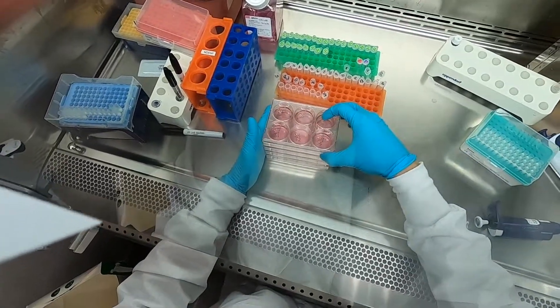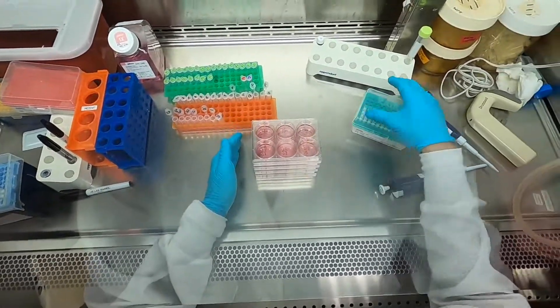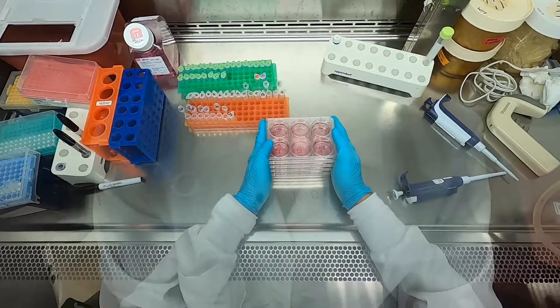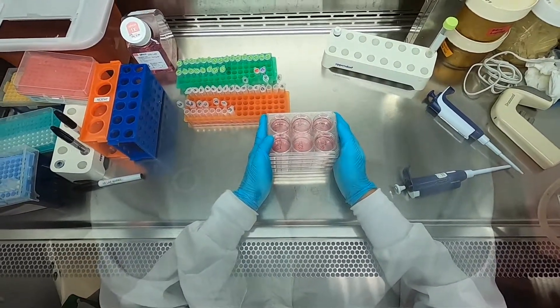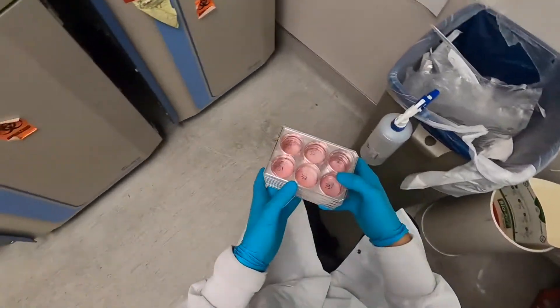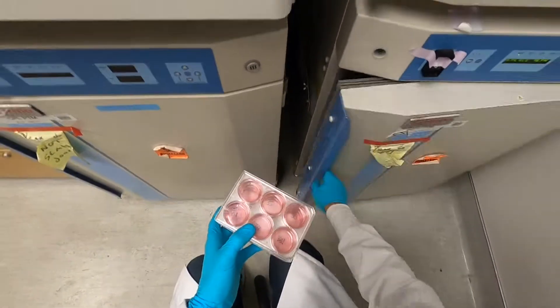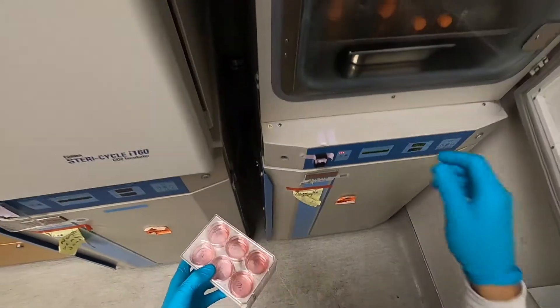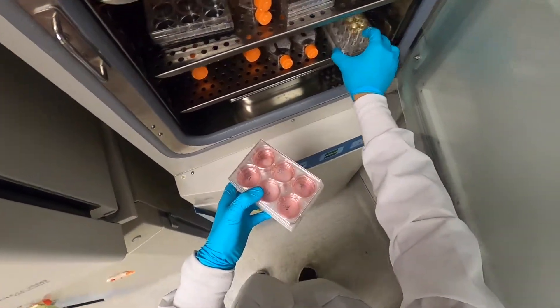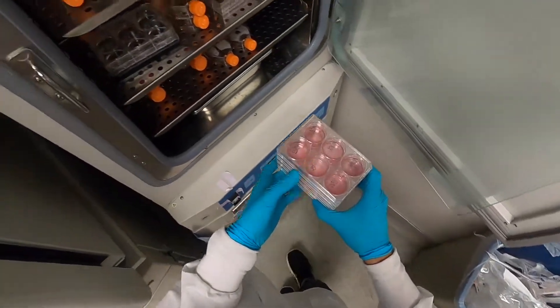There goes the final tube, and right on time — that was about 10 minutes since I added the Fugene to that last tube as well. For good measure, I'm just going to give these plates a little swirl to make sure the transfection mixture is evenly distributed, and then I'm going to replace these plates back in the incubator for 48 hours. After which time I'll come back to harvest the lentivirus out of the supernatant of the cells. And there you have it — how to do a transfection.